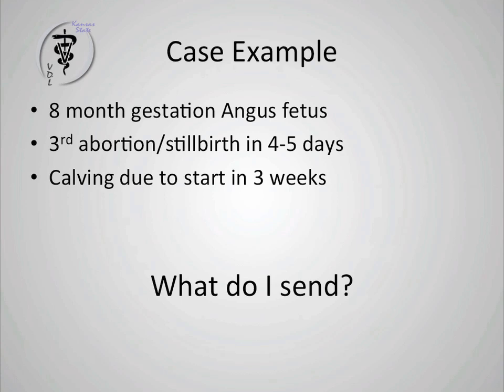And I'm going to talk about everything as if you want to take the samples and send them to us, but always feel free to send us the fetus and we'll take the samples for you and do all the work. And I know people don't want to ship. It's pretty heavy. We do have reduced shipping now, so that might help a little bit.